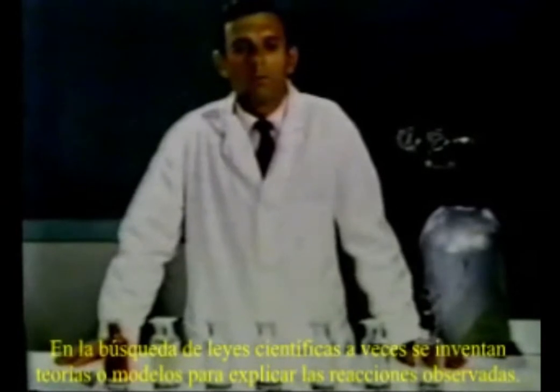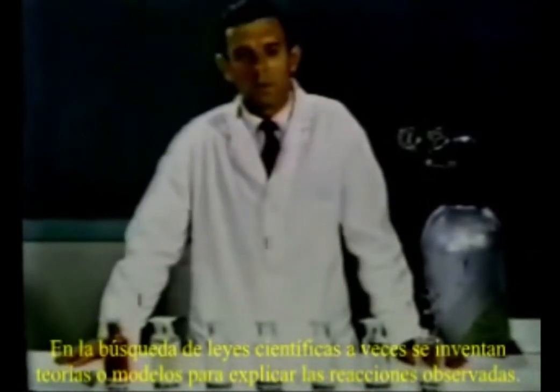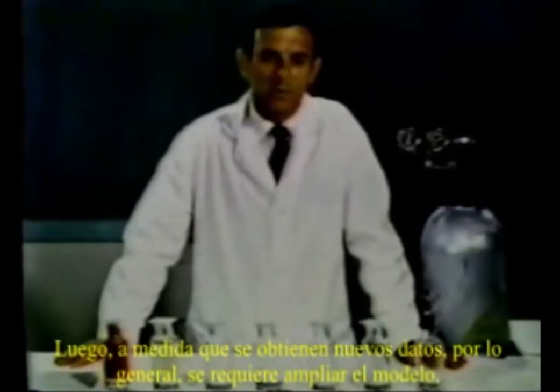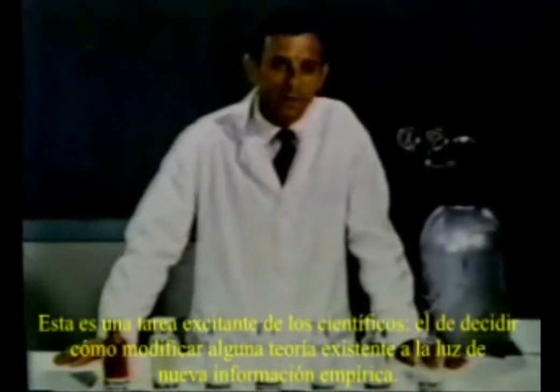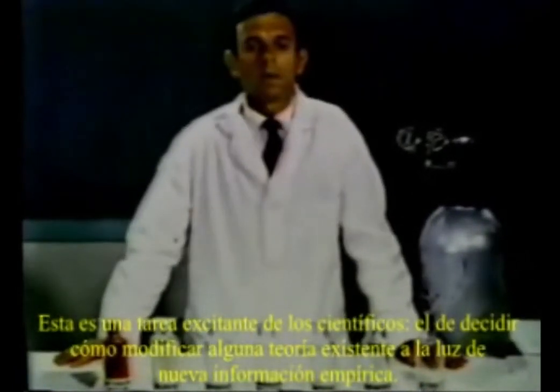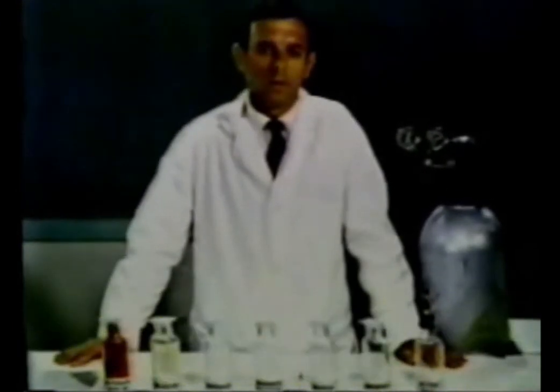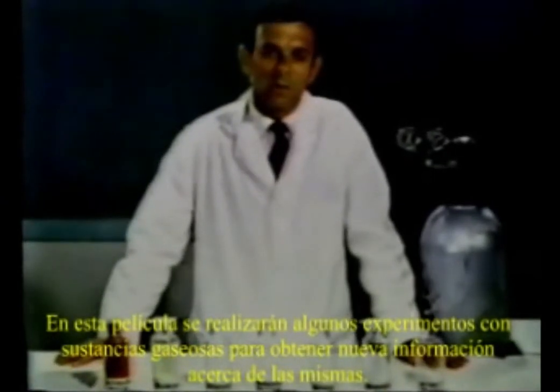In the search for regularity, we devise a model or theory to help us explain chemical behavior. Then, as new experiments bring us new facts, the new facts often require the growth of our model. This is an exciting part of science, to try to decide how to modify an existing theory in the light of new information. In this film, we will perform some experiments on gases to gain new information about them.